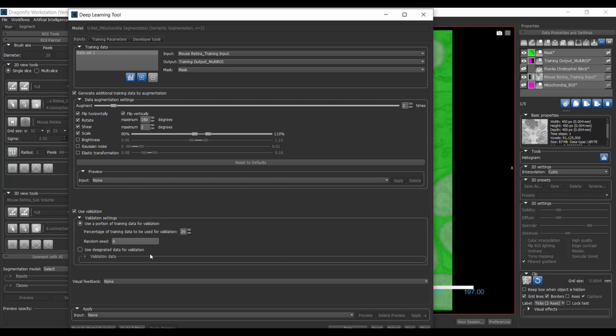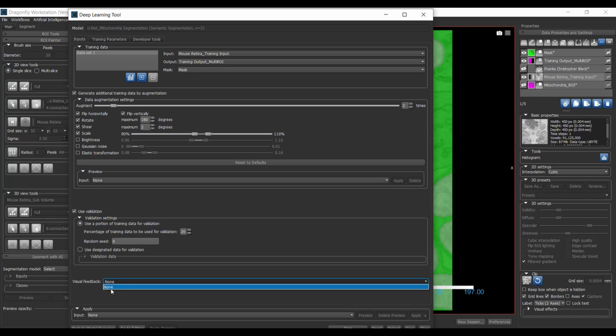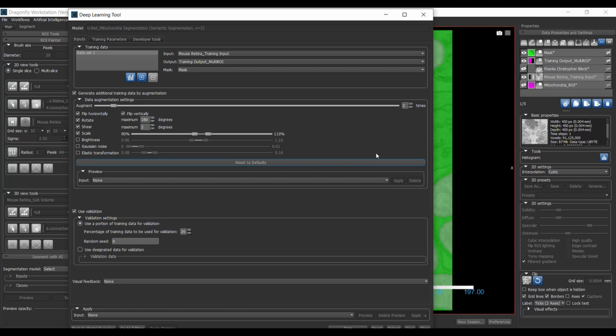The next important feature added here is visual feedback. With visual feedback, we are going to visualize the features learned during the training period. For that, we have to define the region first: which area are you going to visualize?